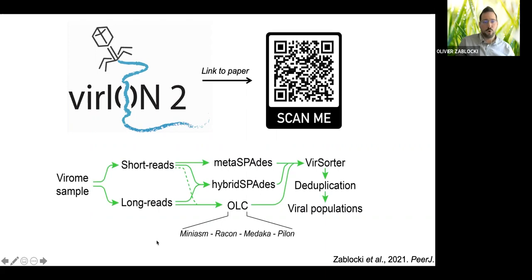And this is just to give you an overview of what we will learn today, which is we try to benchmark and see which tools work and don't work to make full advantage of short reads and long reads to assemble various metagenomes and see the improvements that we could gain, especially since, like I said, there are a lot of tools out there. They evolve quickly, and a lot of them are not specifically tailored for viruses. So we wanted to sort of assess a beginning of a SOP for looking at virus metagenomes.